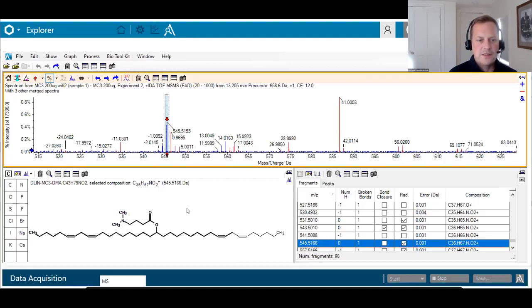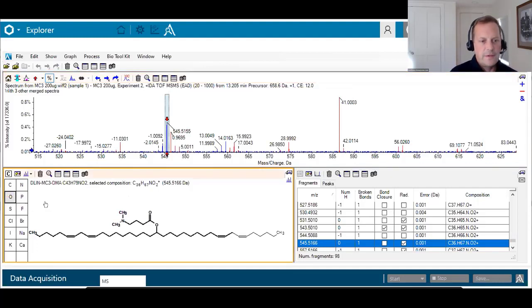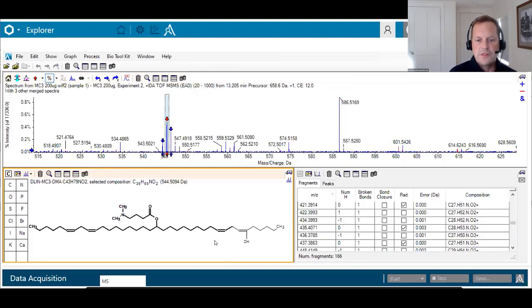So what you can do in the software, and all of a sudden I've got these red peaks here that are not matching to the spectra anymore. So what you can do here is add atoms and change bonds within the mol file. I'm going to grab this oxygen atom here and throw it over here. Again, we know there's oxygen incorporation, but we're not adding two protons, so we can't have an aldehyde here.